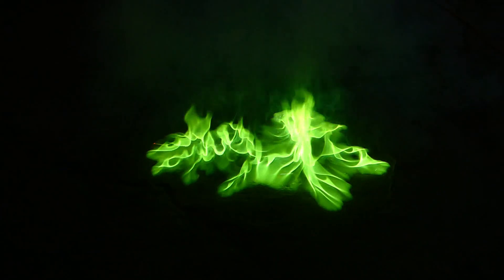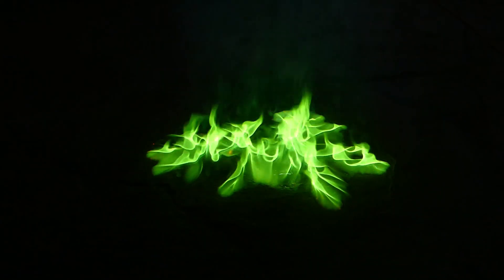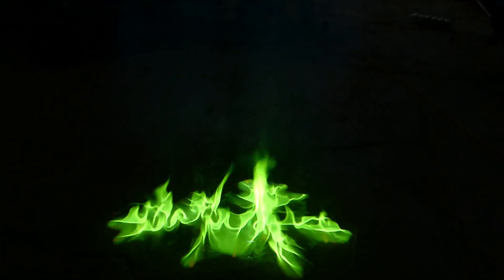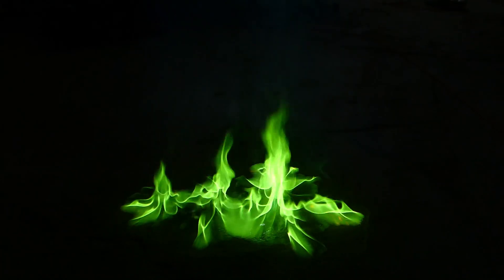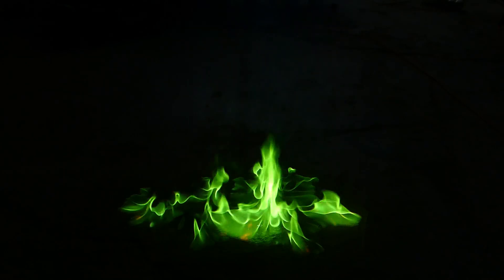Then, before it all evaporated, I quickly ignited it, and the result was beautiful. I now have a puddle of green fire, and to be honest, it is quite fascinating to look at. It is also a nice material for the thumbnail.